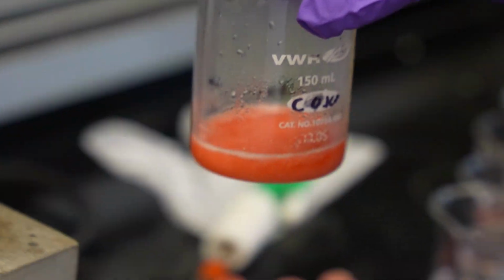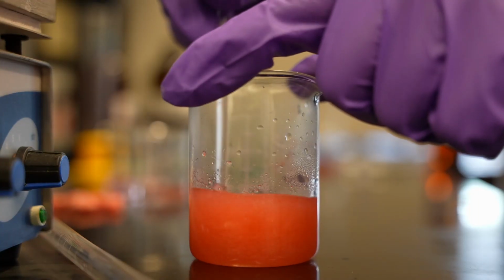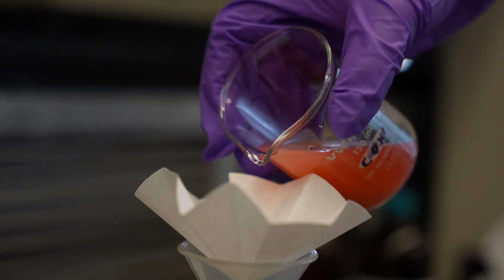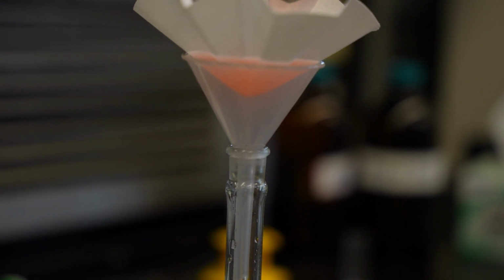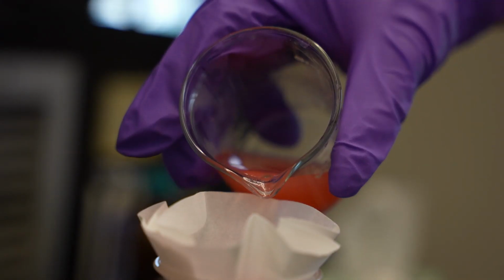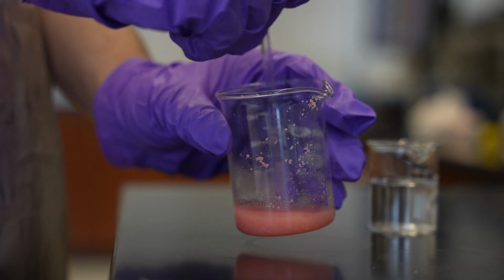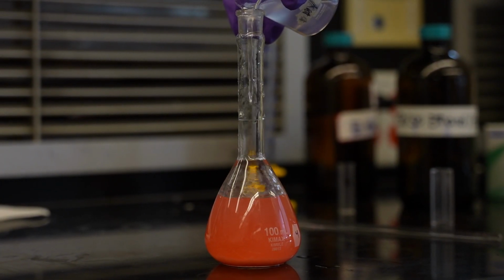Next, take it off the hot plate, cool it down, and add 25 milliliters of ethanol into the mixture and continue stirring for about 5 minutes. Now let the new mixture sit for 10 minutes and then filter it through filter paper to a volumetric flask. Don't let the solid within the solution go through the filter paper initially, as once all the liquid is filtered into the flask, you'll then add about 10 milliliters of ethanol water mixture to help filter the solution back into the flask. Once that is done, add the ethanol water mix until the 100 milliliter mark.